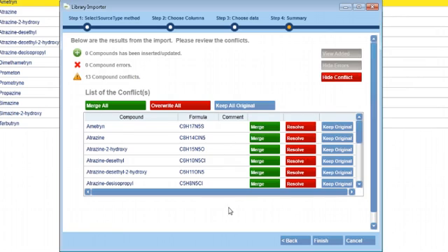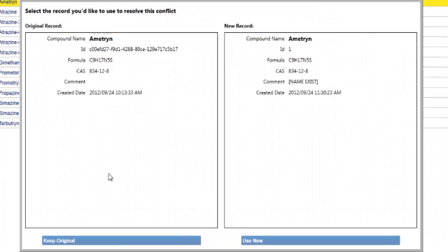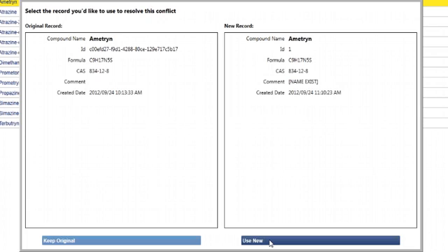You can also look at conflicts compound by compound. Here you have the merge and keep original option, but you also have a resolve option. Select and resolve opens a dialog box that allows you to compare the original record with the new one being imported. Here you can examine the records and decide if you want to keep the original or overwrite the data and use the new record.